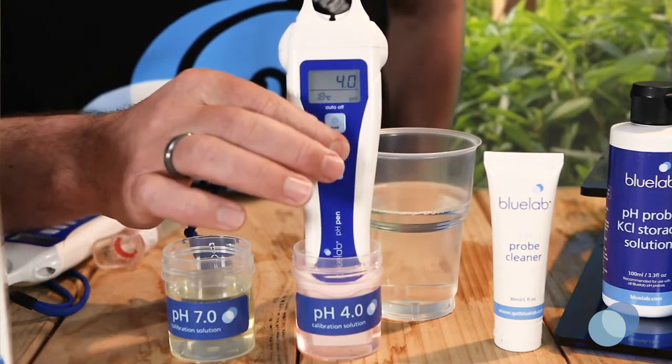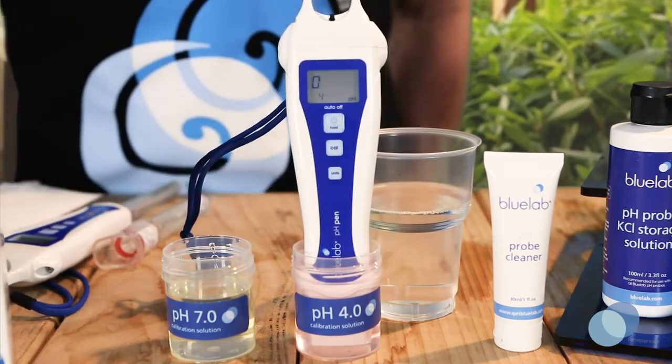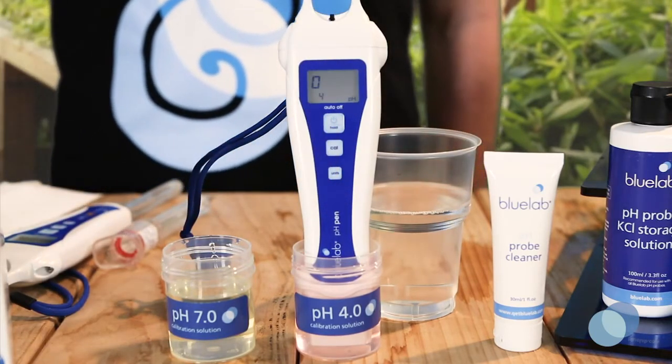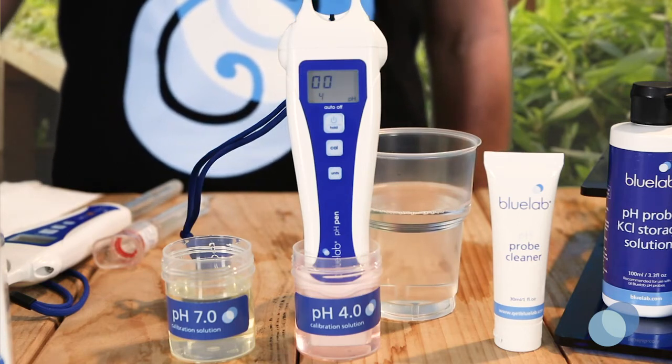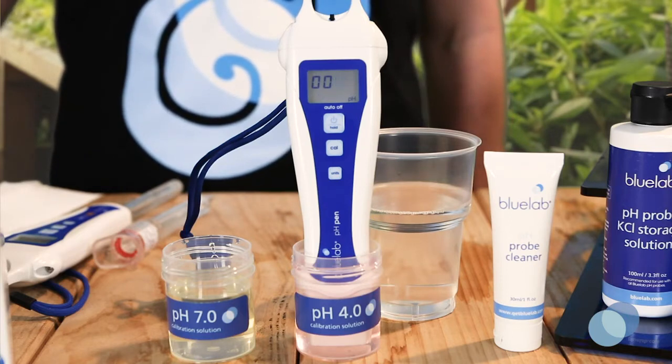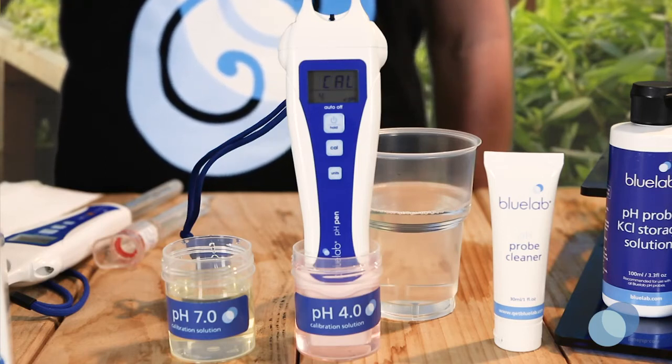Press and hold the Cal button until Cal is displayed on the screen, then release the button. Four small boxes start to flash, indicating the start of calibration. Leave the probe in the solution while the display is flashing. After the four boxes stop flashing, Cal will display on the screen, letting you know that calibration is complete.